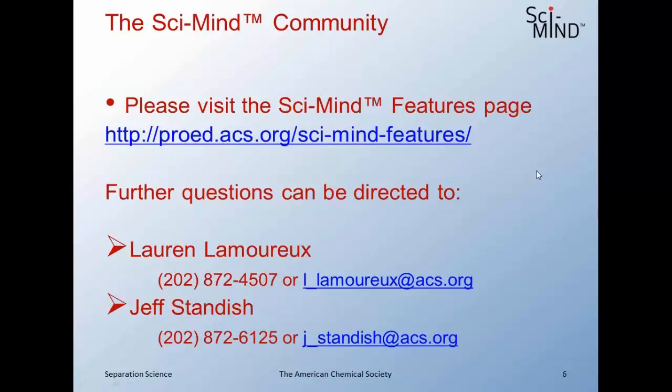So I have a question. It's Bill again. Sure. It's a bit selfish, but I'm going to ask it anyway, because there's so many GC people on here. So is there a generalized chiral GC column out there?